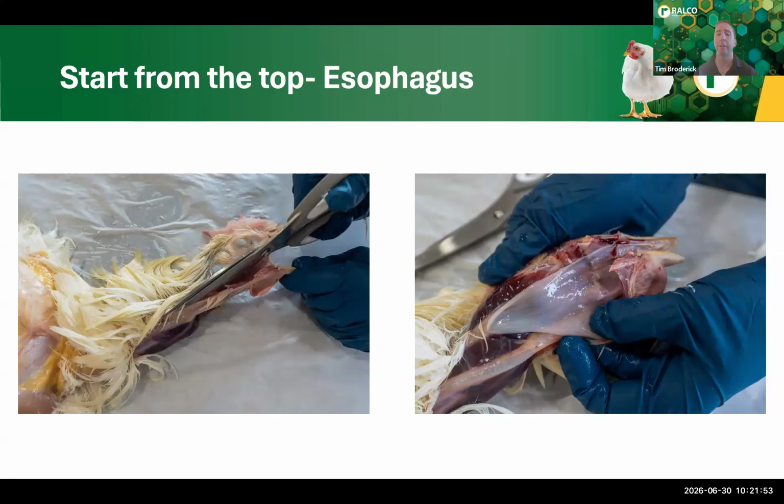We like to make kind of that first cut once we're in the head area, and then there's also others that are more precise that are going to make full cuts into the head, looking at the brain and other more precise organs. For most field postings, especially at the farmer or producer level for checks, we really kind of want to go more in the mouth, making that cut down the neck.